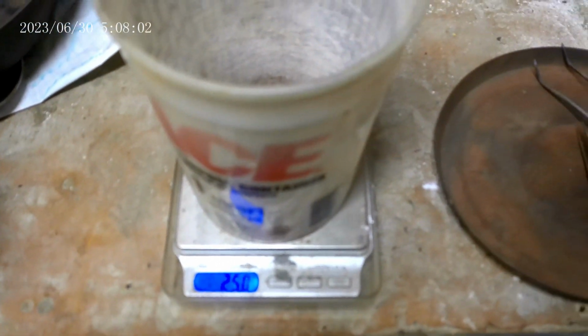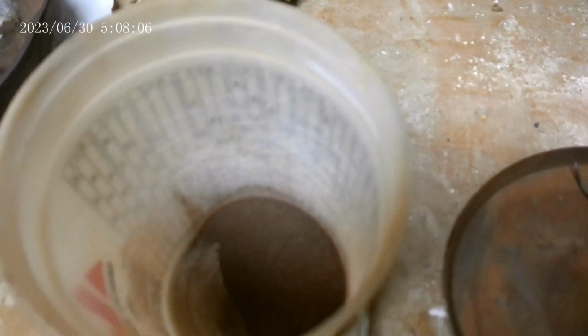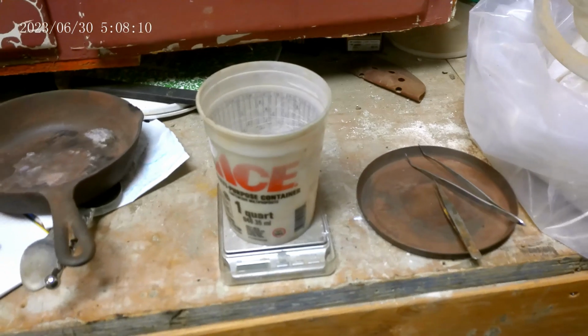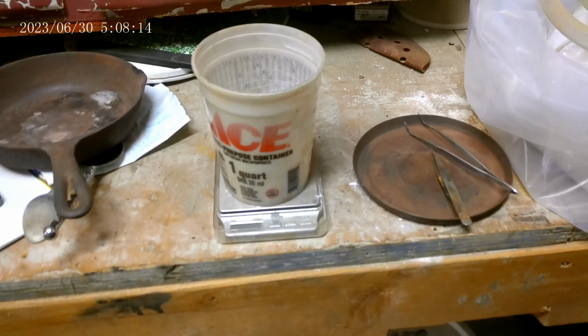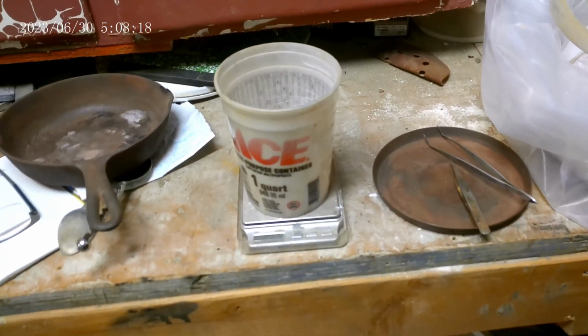All right, so after that acid, we got 25 grams. We had 34.7 before, so we lost about a third of it. So now we're going to get it mixed with flux, get it in the furnace, see what we get. I don't have real high confidence that it'll do better, but hey, maybe. Let's see what happens.